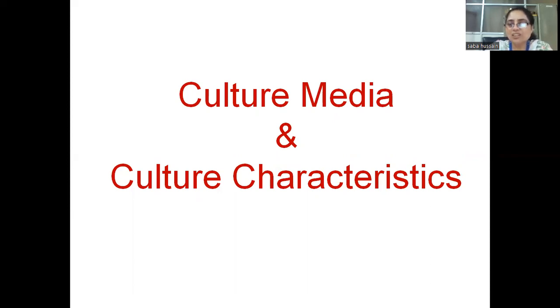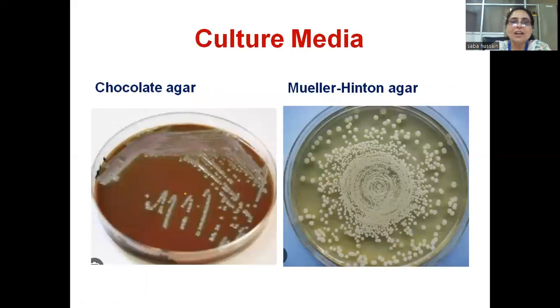Coming to culture media and culture characteristics, it can grow on chocolate agar. And here you can see this is Neisseria gonorrhea growing on chocolate agar.